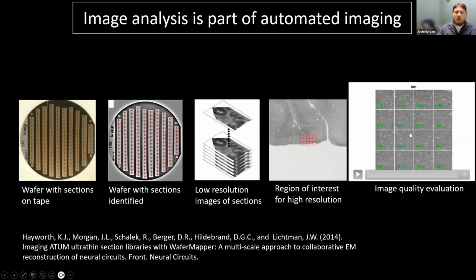And so in general, I really advocate for having these automatic ways of evaluating image quality when you get to the point where you basically are producing more voxels than anyone can look at, at least while it's acquiring. So, this method of image evaluation, it's a little kernel we wrote that compares structured contrast to unstructured contrast. You can use Fourier analysis, signal-to-noise analysis.